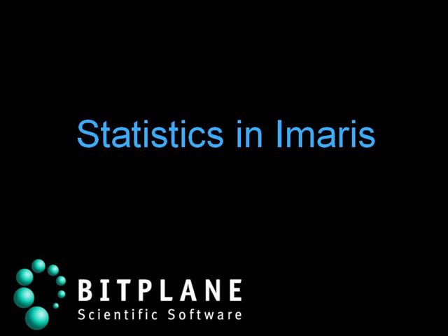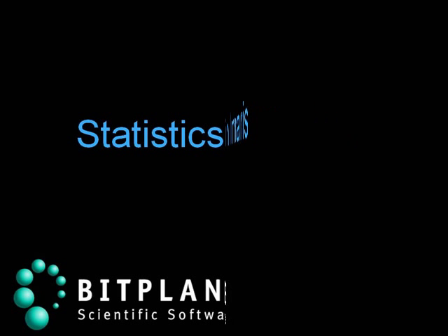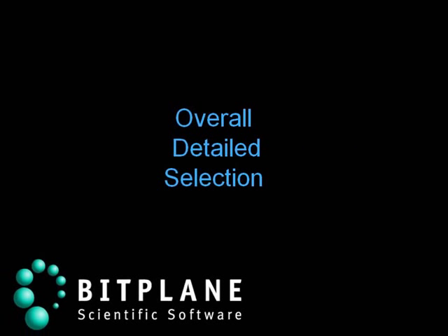This tutorial describes how IMARIS displays, exports the calculated statistics, and illustrates the direct two-way link between the IMARIS 3D, 4D environment and the statistical output.